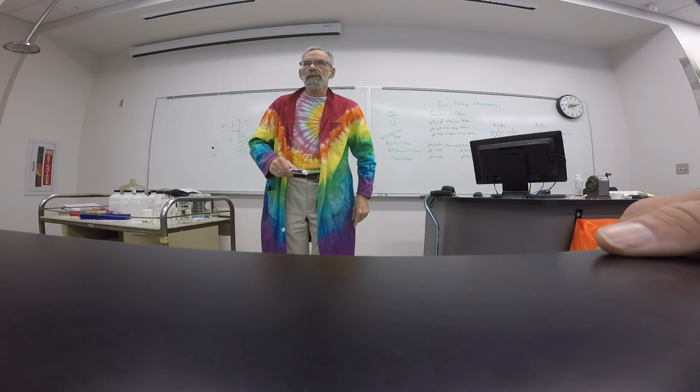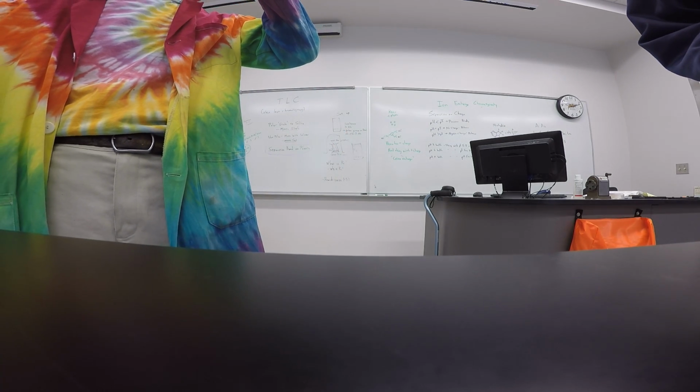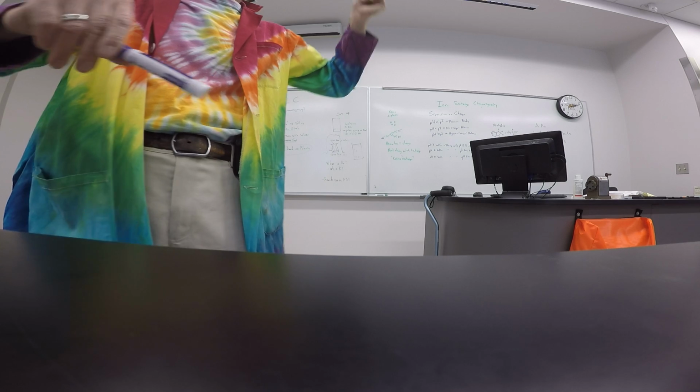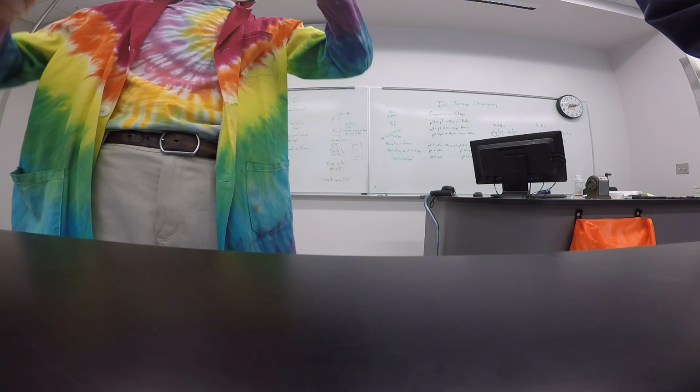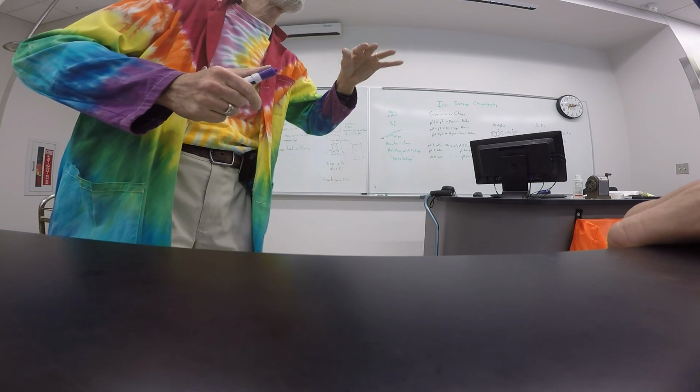This set of 3 people here might only let it develop and bring it up 5 centimeters. That group over there might have let it develop up to 6 centimeters. And so with you 2 guys trying to compare data and trying to come up with the same set of unknowns, if you travel 2 different distances because you had 2 different groups of data, you can't compare them. But using the RF factor makes it independent of how far you actually move, because it's just what fraction of movement you got. So that will make it so you can compare everything.